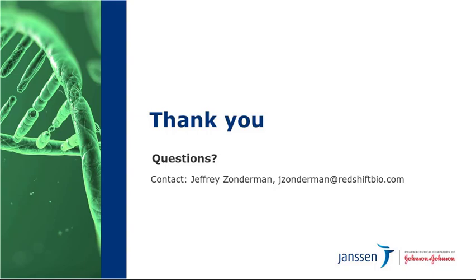All right. And Steve, since you're on, we have a question specific to one of your slides. The delta graph that you presented, you can see, well, I'm not sure what the questioner is asking, but differences. Can you see differences in 15 minutes at low pH? So from our pH 7 sample to the pH 3.5 sample, yes, those differences were there.